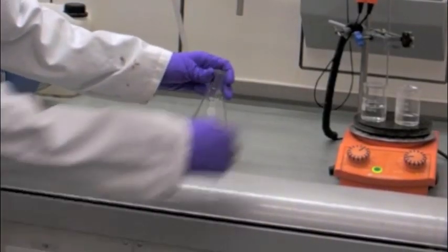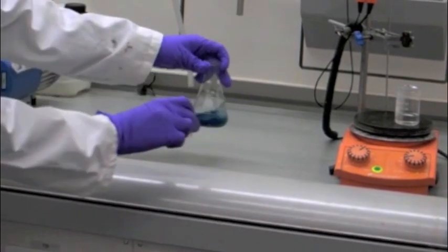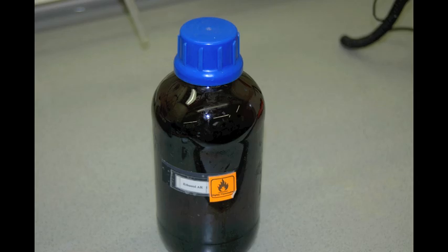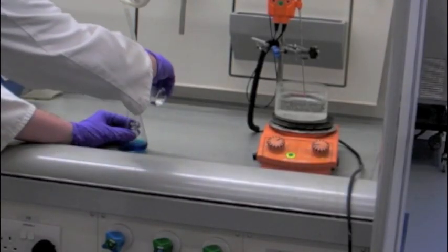Next, we dissolve this in 25 millilitres of hot distilled water. A clear blue solution is observed. 15 millilitres of AR ethanol is then heated to about 70 degrees Celsius and added to the copper-acetate solution.